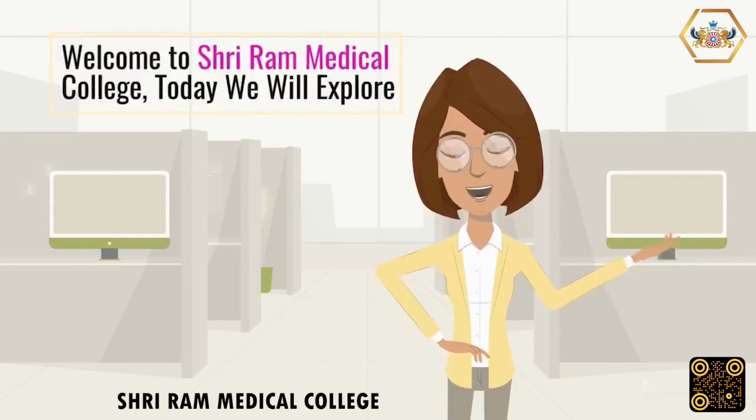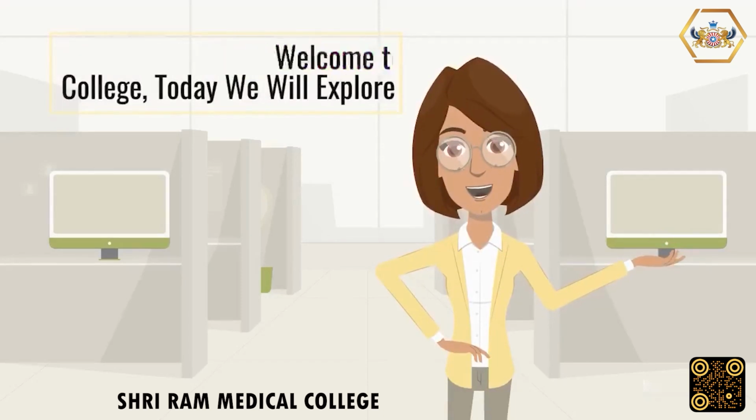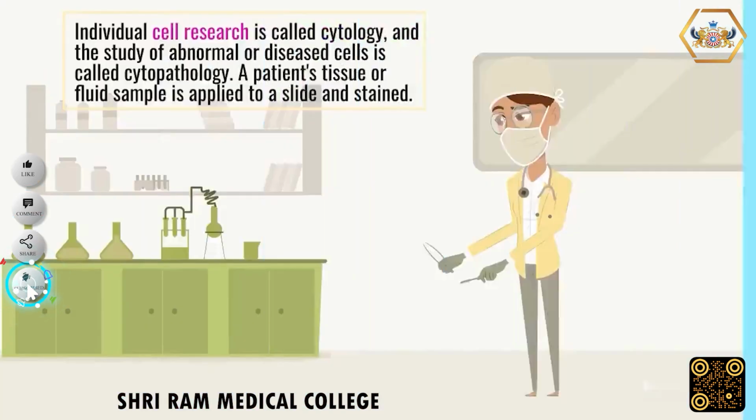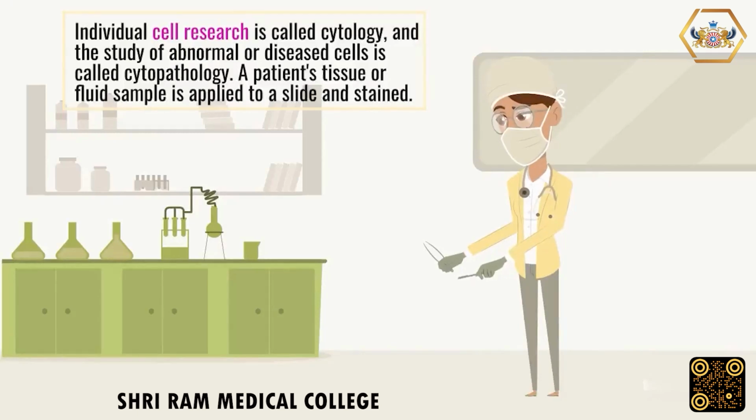Today we will explore the importance of cytopathology in early cancer diagnosis. Individual cell research is called cytology, and the study of abnormal or diseased cells is called cytopathology. A patient's tissue or fluid sample is applied to a slide and stained.